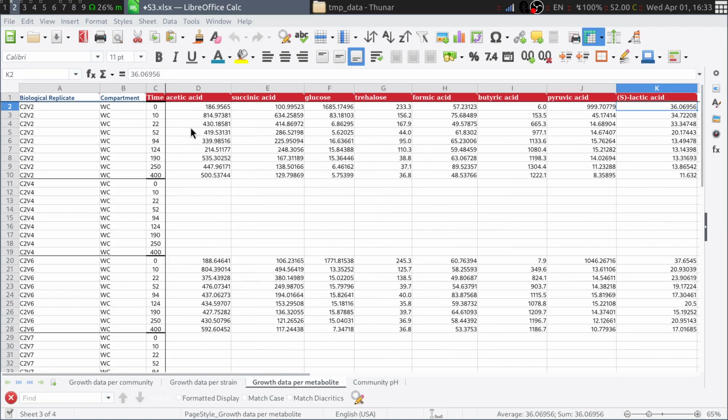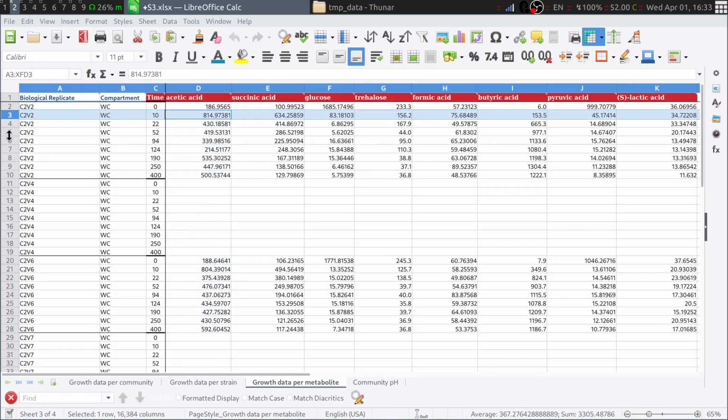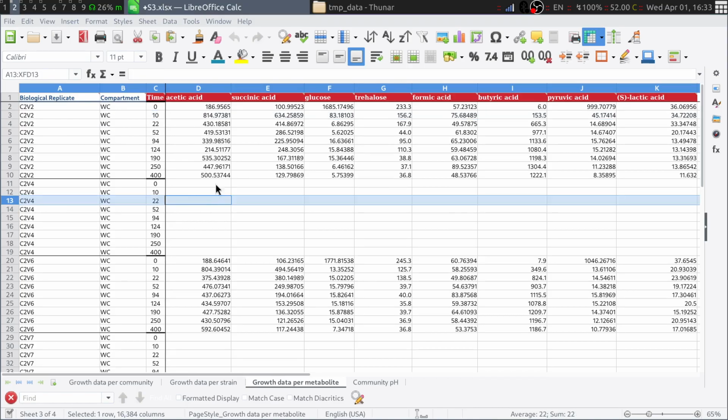It is usable. But as you can see, this particular template has different fonts and columns because it's been copied from a different sort of data. None of this matters. What the system looks for is the name of the column and the specific information in each of the rows. If there's no data in this row for this column, nothing is recorded.